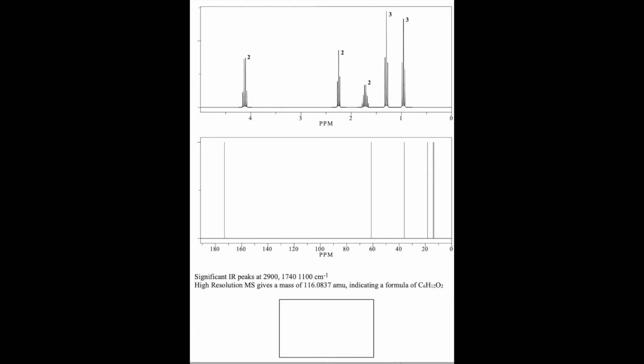The only other carbon in the spectrum that's interesting is this one at about 60 ppm. That's in the electronegative region, and that tells me I have a carbon that is single bonded to an electronegative atom. And because I know the formula, I now know that that carbon is bonded to an oxygen. Again, that reinforces what we learned from the IR. The IR had a peak at 1100 wave numbers, and that was corresponding to what we believe to be a CO single bond stretch. The other 4 carbons are all generic. That really doesn't tell me much. So from the C13, we really didn't learn a whole lot of anything new, except that all 6 carbons are unique, and it reinforced some of the things we learned from the IR.